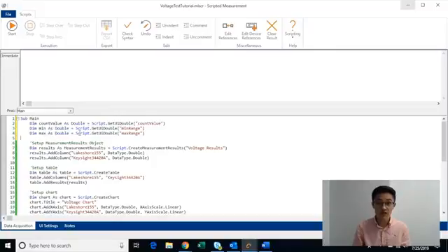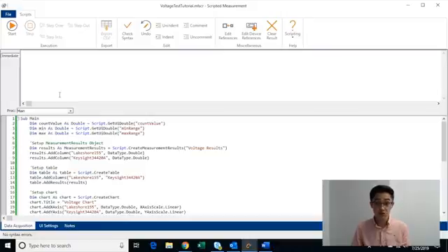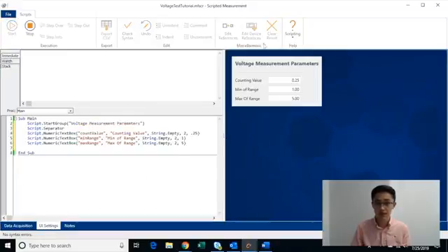And now that we have created these variables that are initialized by whatever the user enters into the UI, we can go ahead and substitute them into the rest of the script. Now we are finished with our script and we can go ahead and test it. So to test it in the scripting pane, we're going to want to first go to the UI settings tab and then click run. And you can see on the right hand side our UI was created.